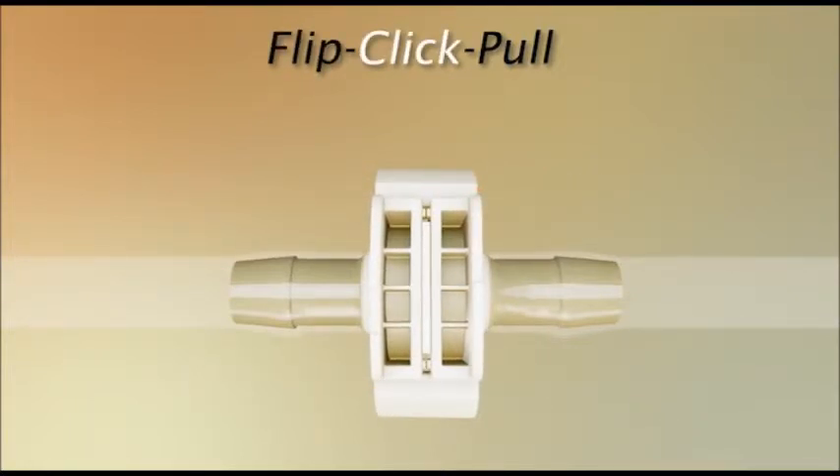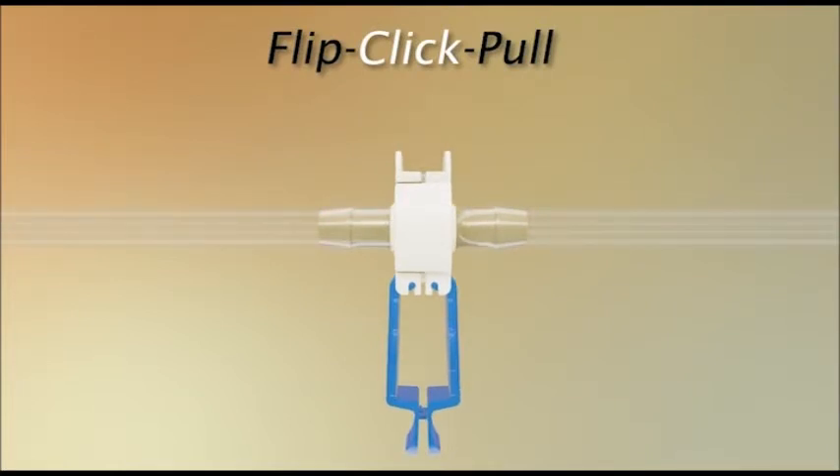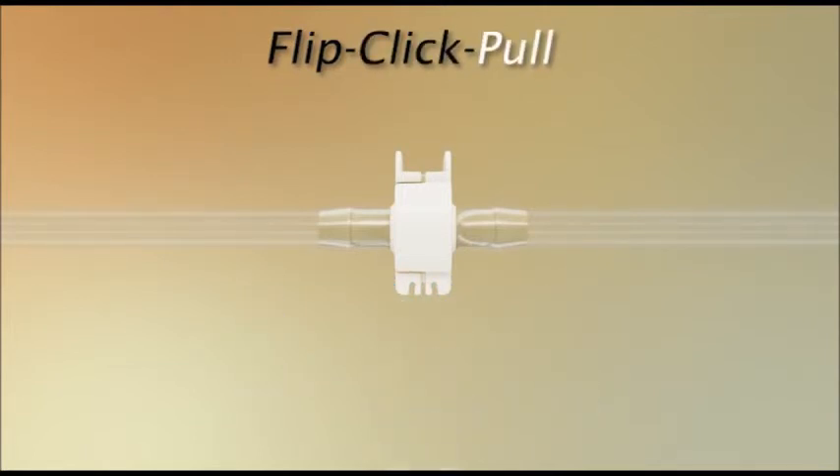To guarantee you have made a robust connection, visually confirm both sides are flush and parallel. To complete the connection, simply snap the pull tab covers together by pushing on the CPC logos, then pull the membranes from the connector.